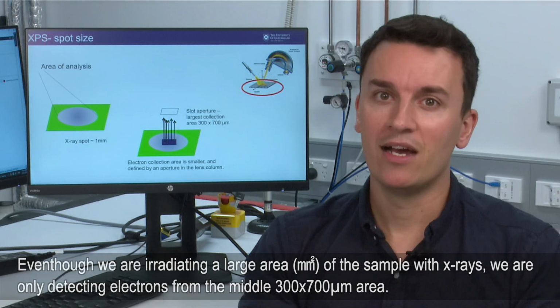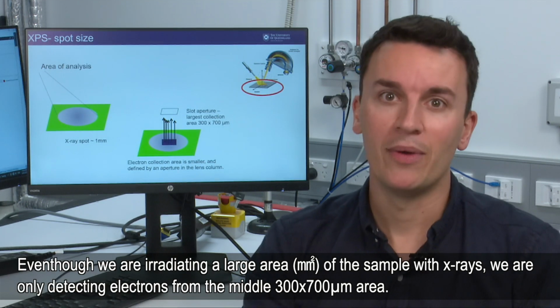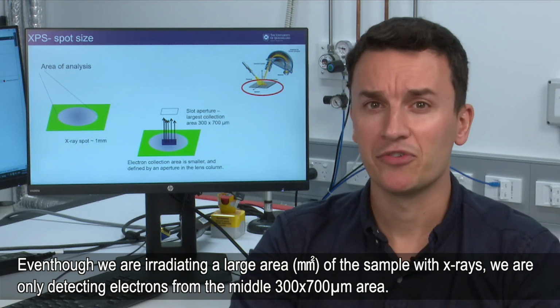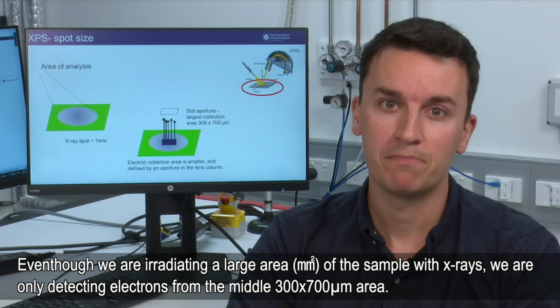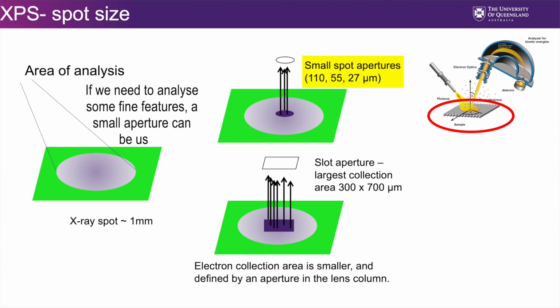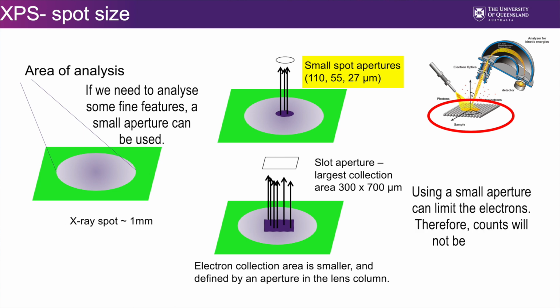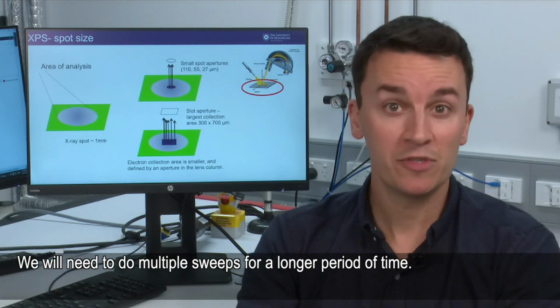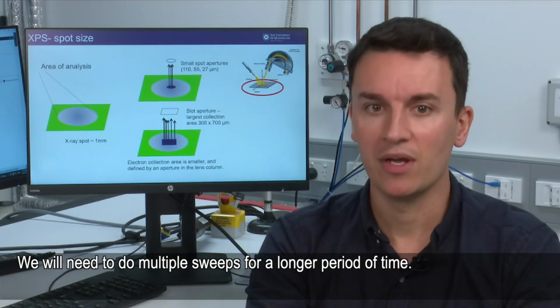Even though we're irradiating a wide area, like in the order of millimetres squared with X-rays, we're only detecting electrons from the middle 700 by 300 microns, which is good for most samples, but if we do need to get down to some fine features, we can use a smaller aperture. So we can use down to 27 microns, but we just need to bear in mind that at this level of aperture, we are really limiting the electrons, and therefore the counts aren't going to be as high. So we're going to have to do multiple sweeps and look at this for a longer time.